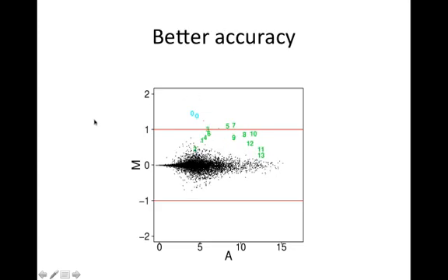So with GCRMA, we do get a recovery of signal. These zeros go way up, the 2 and the 1 go up, but we also get a little bit of added noise. So you see that some of these black points, which should be 0, also went up a little bit. So that's what GCRMA does. It can help you bring out some of the signal at the bottom. It's not as robust as RMA, but it does have that property. So some people prefer it because of that. Other people prefer the stability of RMA.